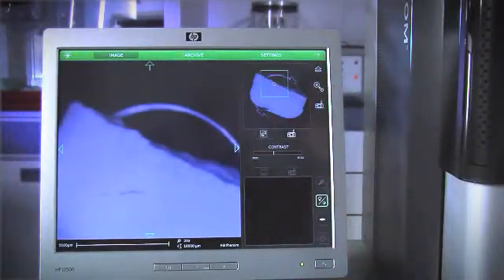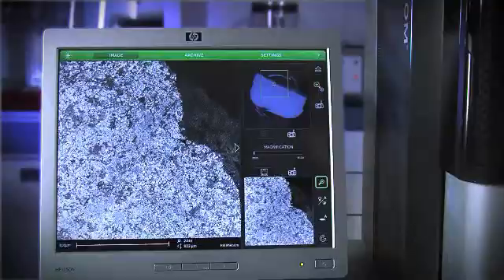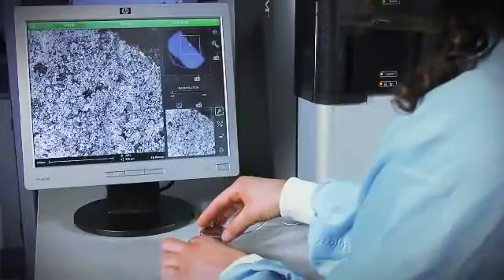Touch to center the object. Touching the toggle button initiates SEM imaging.